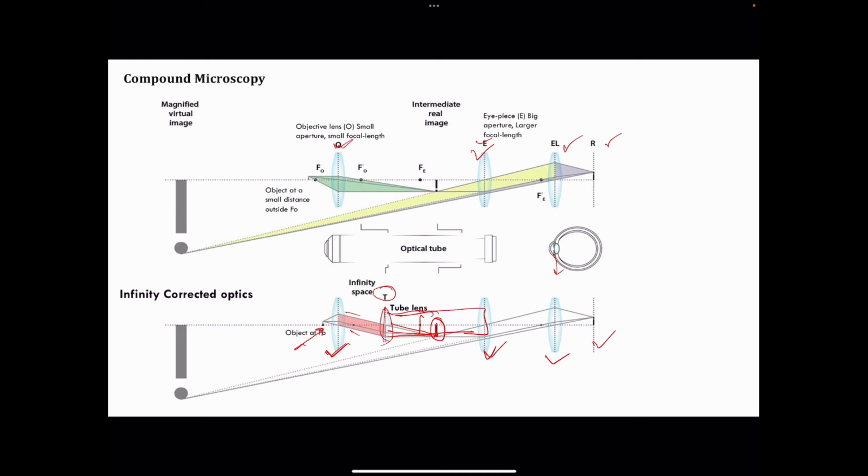So the answer to this question is, if you look at a modern day microscope, a compound microscopy setup, you would see that it has a lot of additional elements that need to be incorporated for the specific type of imaging your sample requires.